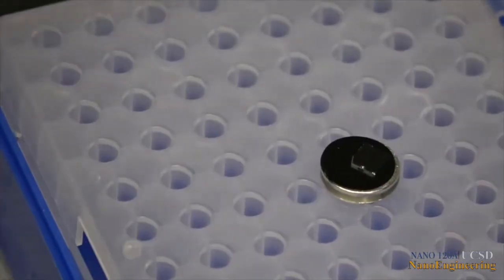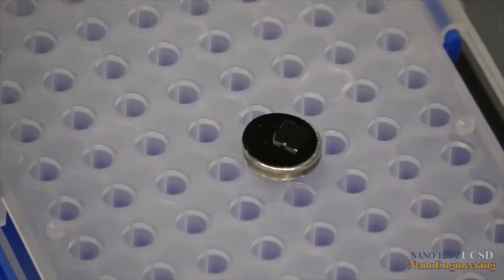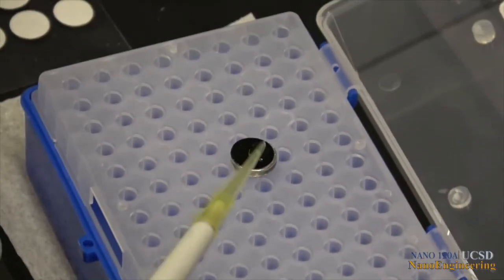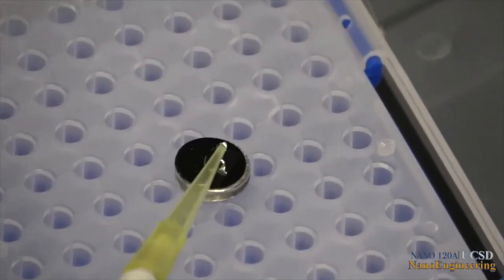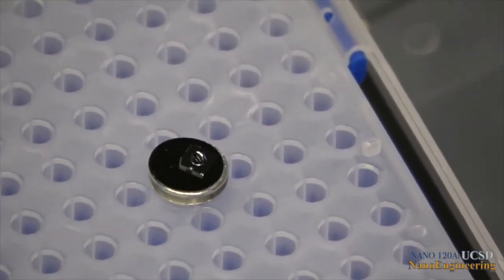Using a pipette, place a drop or two of your colloid on the surface of the silicon. Allow the liquid to dry completely before inserting the sample into the SEM. All samples must be totally dry prior to insertion into the SEM.